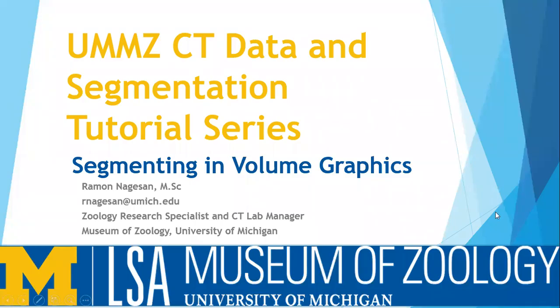Hello, and welcome back to another video in the University of Michigan Museum of Zoology CT Data and Segmentation tutorial series. Today, we're going to be talking about segmenting in Volume Graphics.